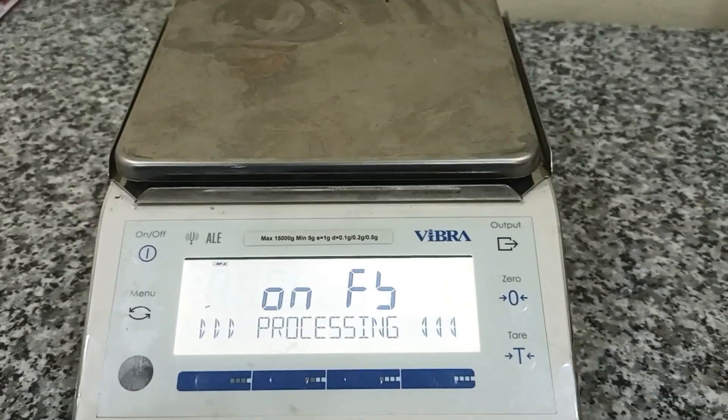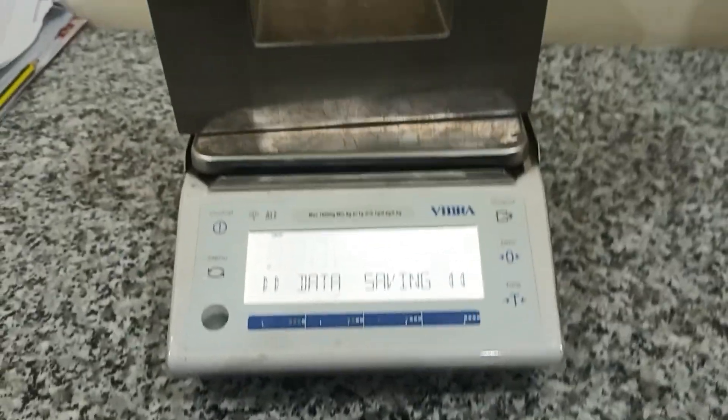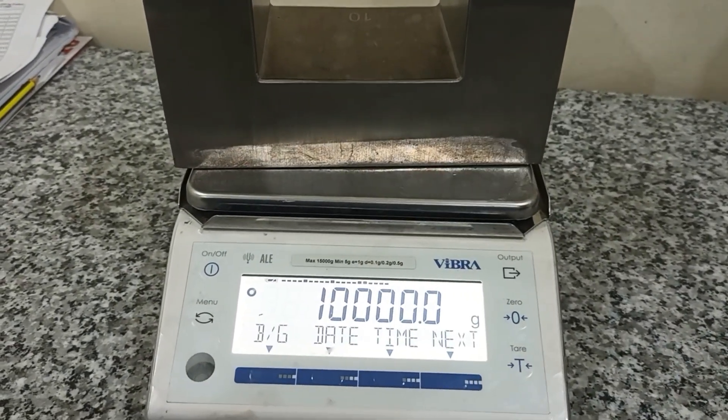Okay, wait — I will put the standard on the pan. Yes, 10 kg. Okay, the menu is okay.